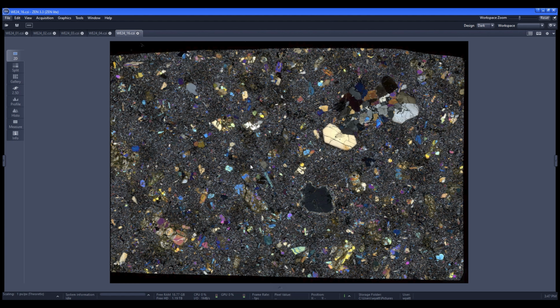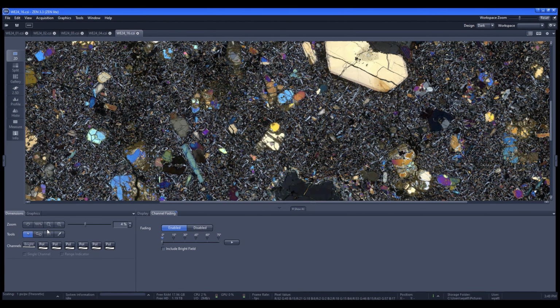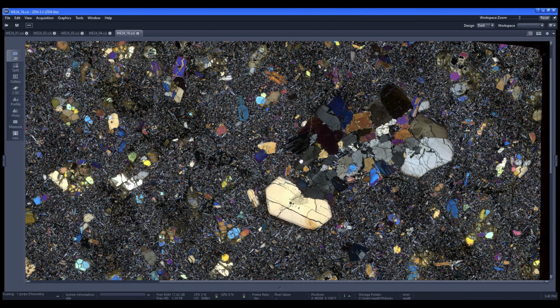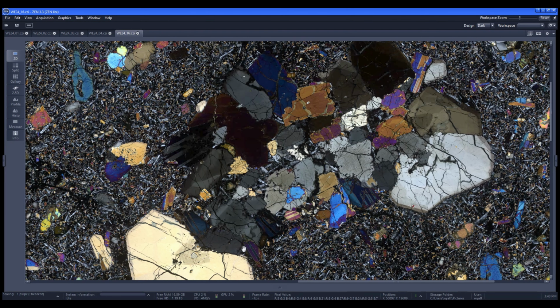Now, this is a mafic rock. The last ones I showed you are probably basalts. Now, this rock is not a basalt. This has a lot more alkaline elements, I should say, and it also has lower silica. This is a basanite.